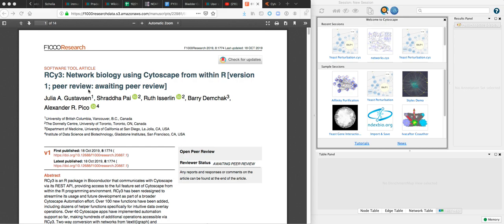RCy3 is a Bioconductor R package that allows you to connect to a local running instance of Cytoscape from within R.